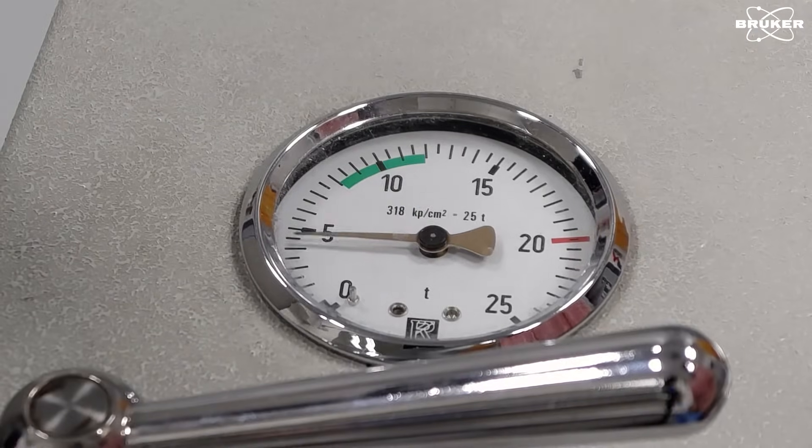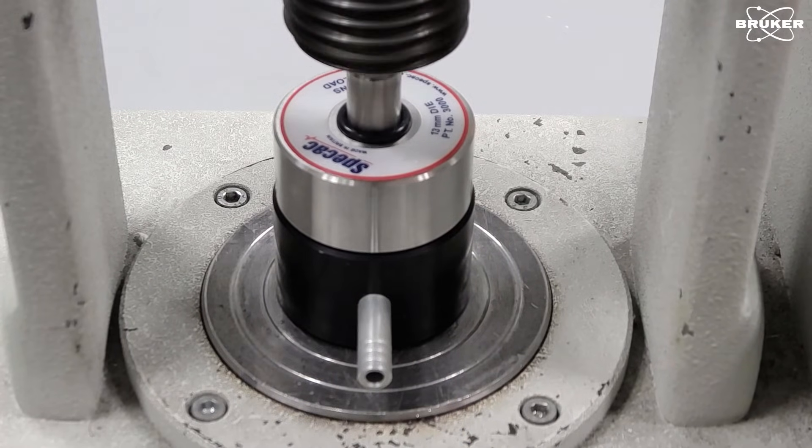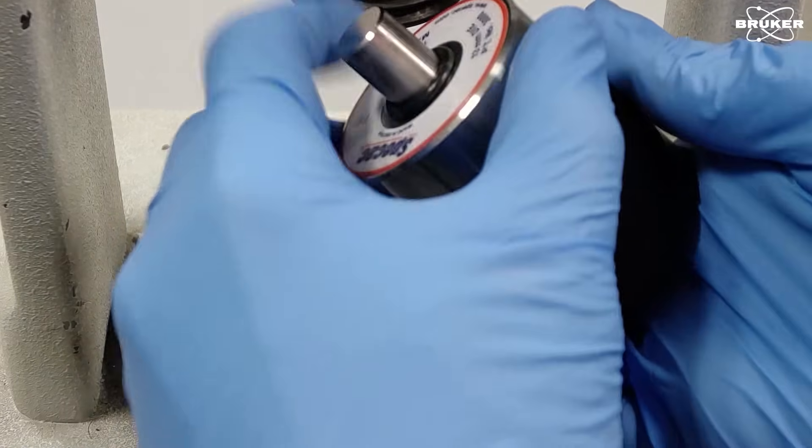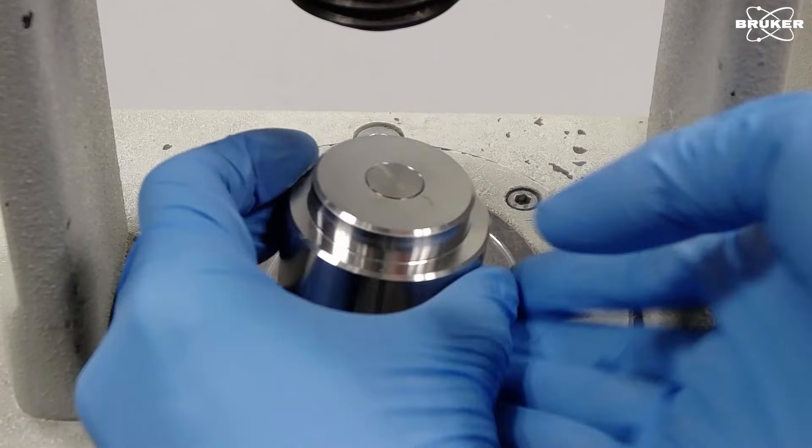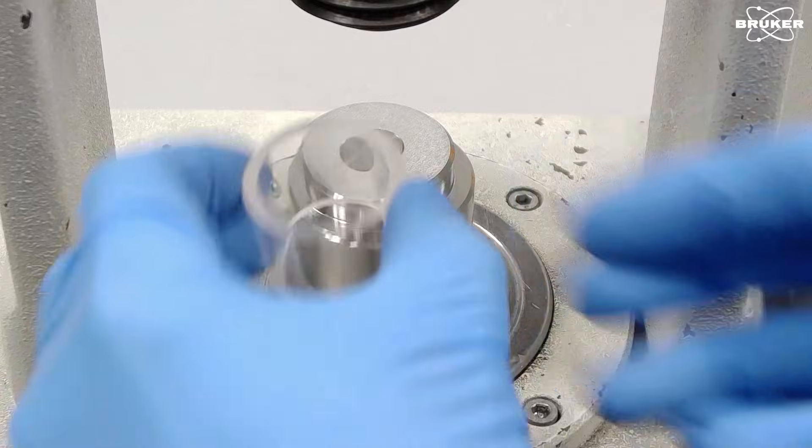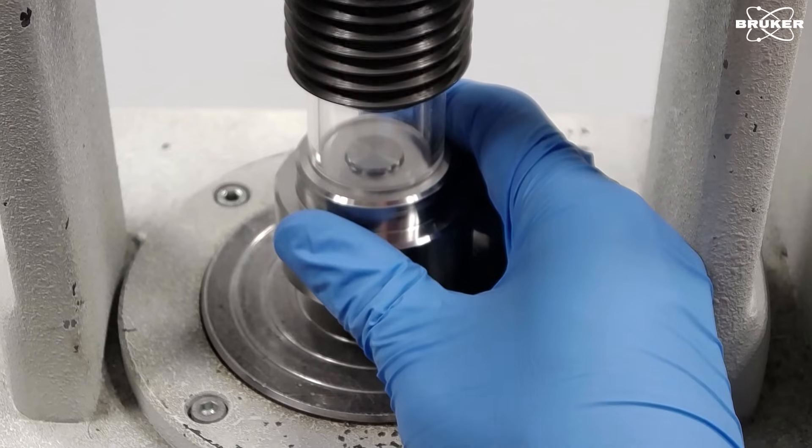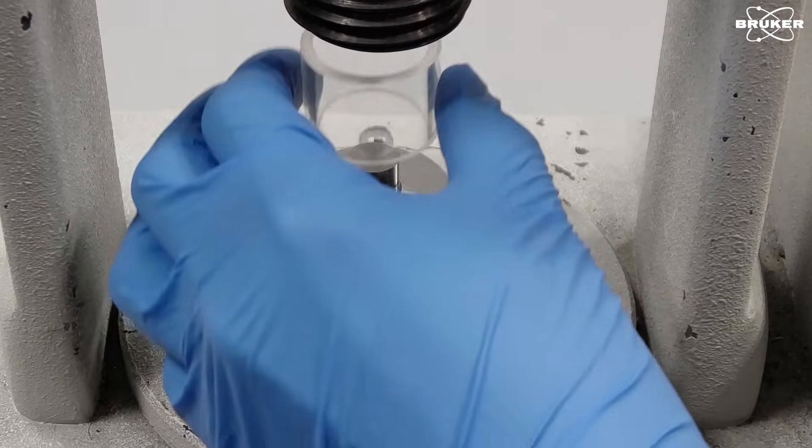Then release the pressure. Take out and disassemble the pellet die. Prepare it for pellet extraction and transfer the pellet die to a safe place.